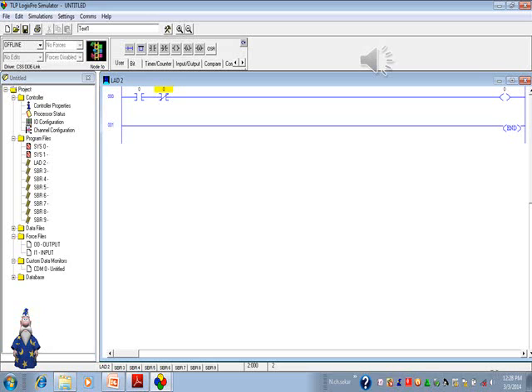Software details: the software RSLogix 500 we used. Supporting software is RSLinx Gateway. Configuration drivers EMU 501, SLC 500, DH 485. Controller properties is Bulletin 1761 MicroLogix 1000, DH 485. Here we created a program for column chromatography.